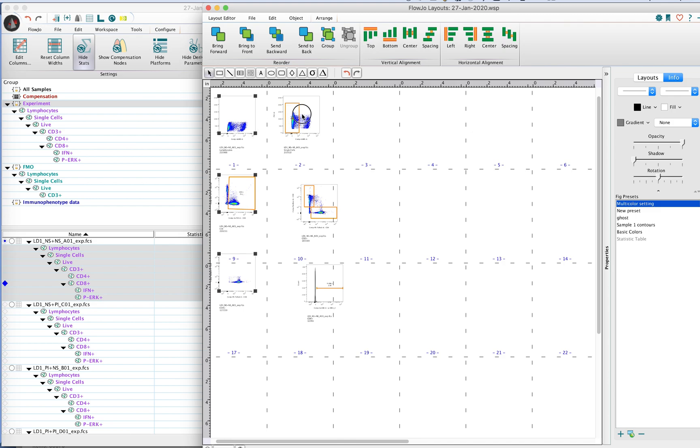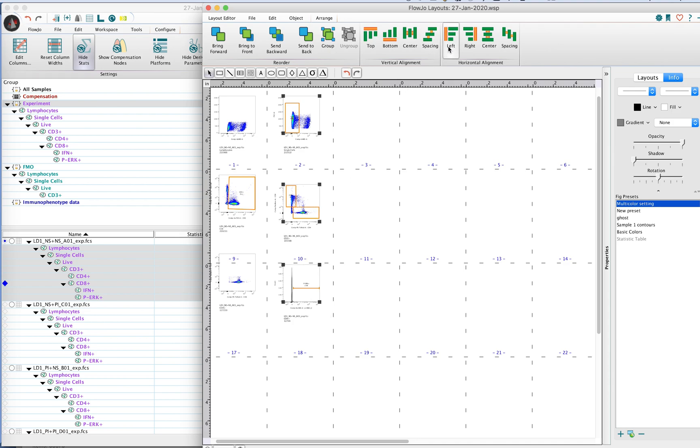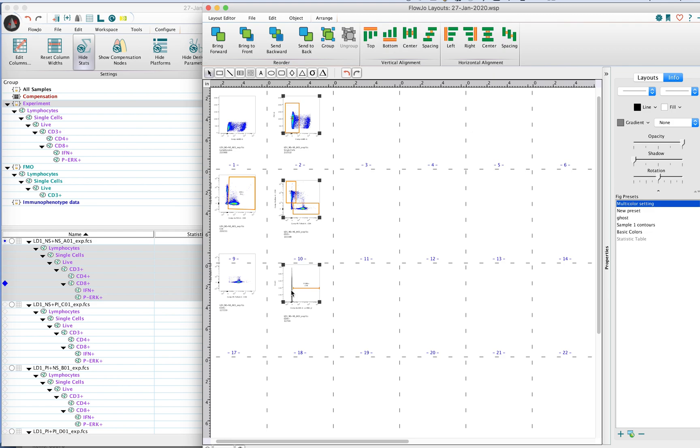With the second column, we want to do the same thing—align left and then do some vertical spacing here. However, because there's more distance here between the latter plot on the right versus the one on the left, the vertical spacing is going to be a little bit different.